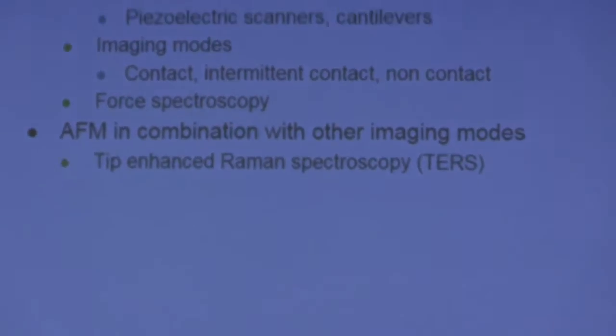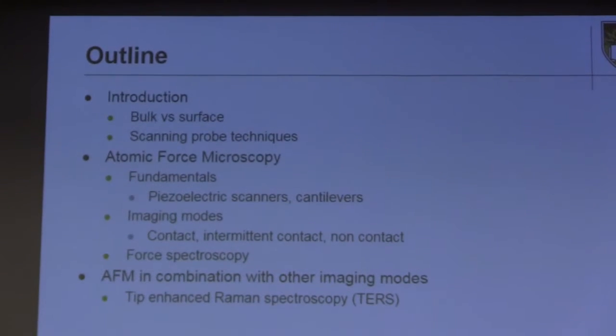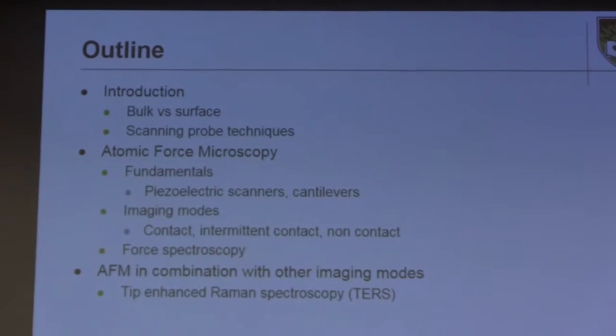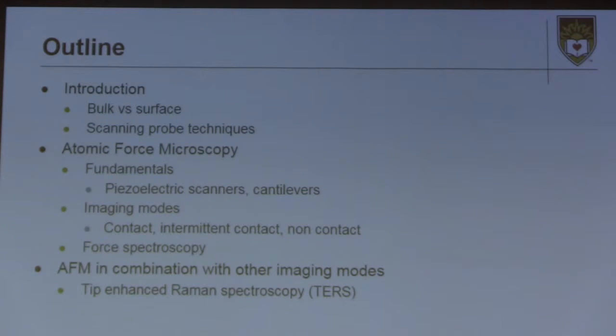Okay. I'll go briefly over the concepts of bulk and surface, because they are obviously very important for this meeting. Then talk about scanning probe techniques, which are very different from what we talked about up till now. Then I'll focus on atomic force microscopy: the fundamentals, how things work, the most important parts, imaging modes, and then what we can do beyond simple imaging. There is force spectroscopy, and then the fancy stuff, as Israel said.